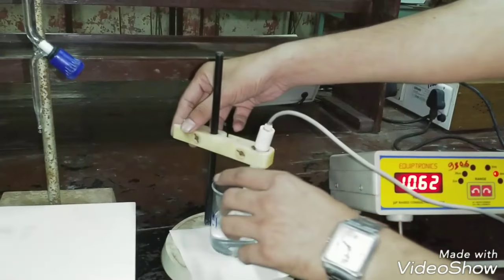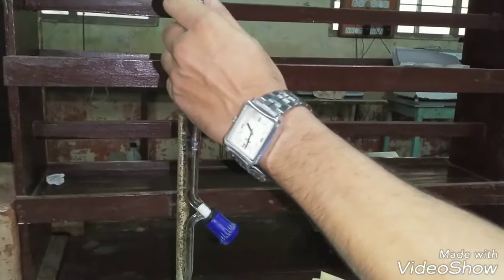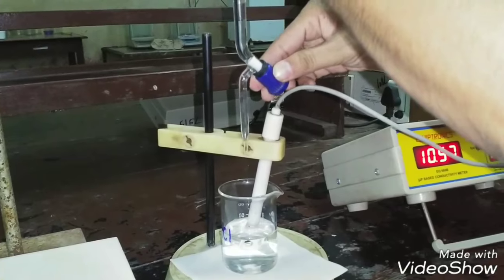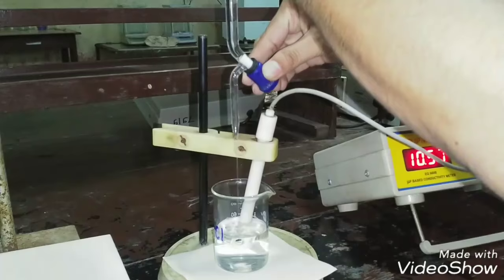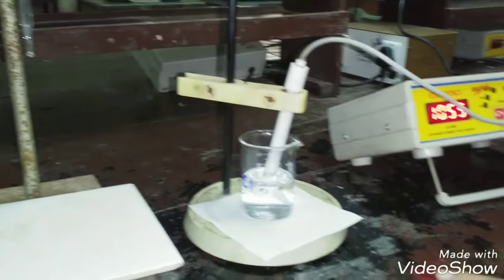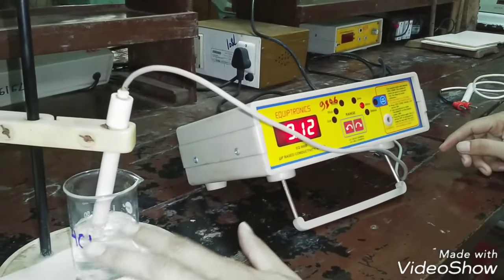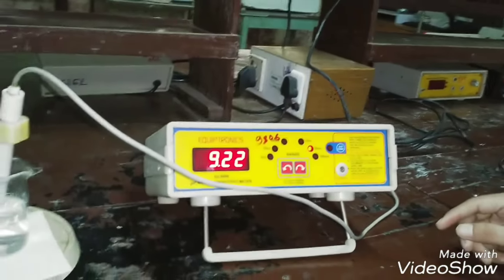Now, when we add strong base that is NaOH which is taken in the burette to the HCl solution, the acid-base neutralization reaction takes place. During the neutralization reaction, when we add NaOH solution to acid solution, from the HCl solution, fast moving H+ ion is replaced by slow moving Na+ ions and due to which conductivity starts decreasing.